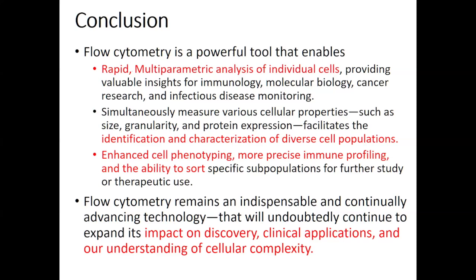In molecular assays, there is always a problem with contamination, because you remove the DNA. The cell is no more with the DNA. All the DNA you pull and do, and some contamination of DNA can happen. But flow is a cell-based analysis. You analyze the cell, right? And it provides valuable insights in immunology, molecular biology, cancer research and infectious disease monitoring, right?